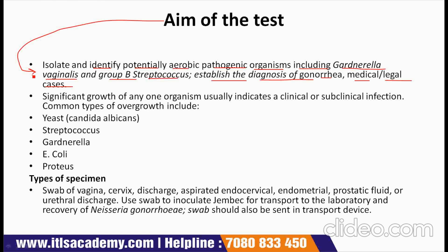A genital culture allows the organisms present in the vagina to grow to levels enabling identification. The vagina is not sterile but contains a mixture of aerobic, anaerobic, coliform and skin bacteria as well as a few fungi. Normally, these are in balance with no particular predominant organisms.